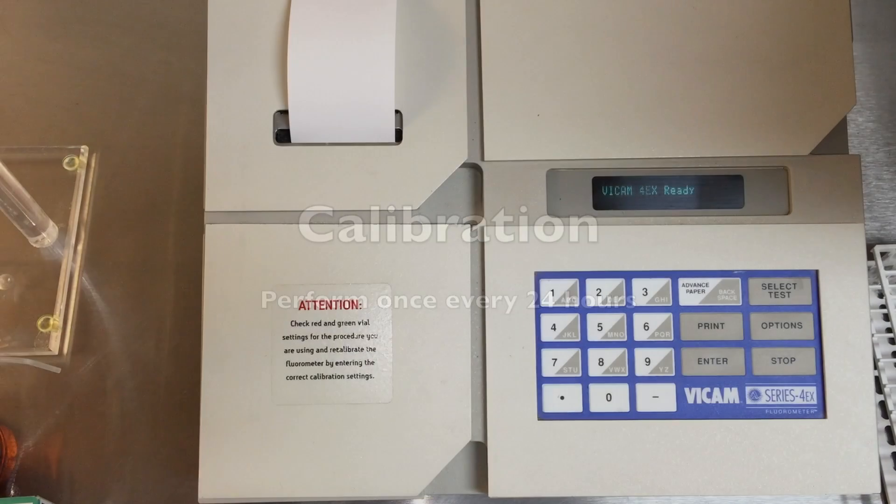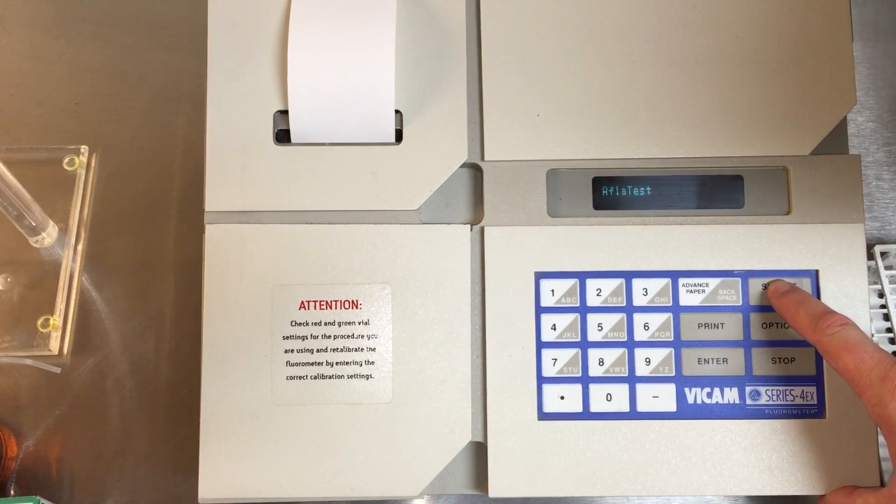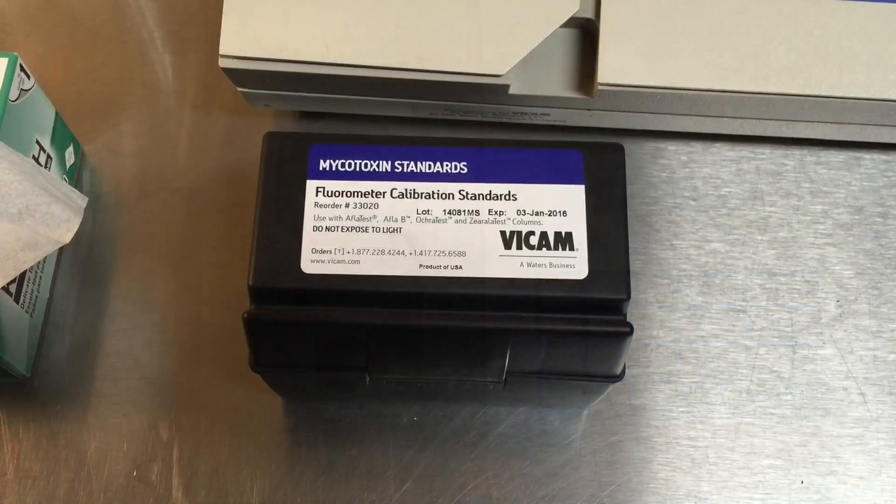The Vicam fluorometer should be calibrated every 24 hours. Turn on the fluorometer and press Options. The first option is Calibration — press Enter. Press Select Test until the display shows AFLATEST and press Enter.